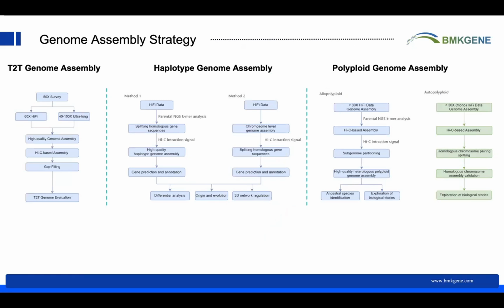And for different levels of assembly, we have different assembly strategies. For T2T, from here you can see we will use the double coverage HiFi data to do the assembly, and also use the ultra-long reads to do the gap filling to get T2T levels.